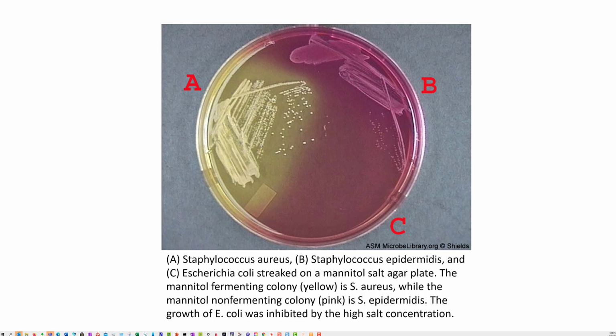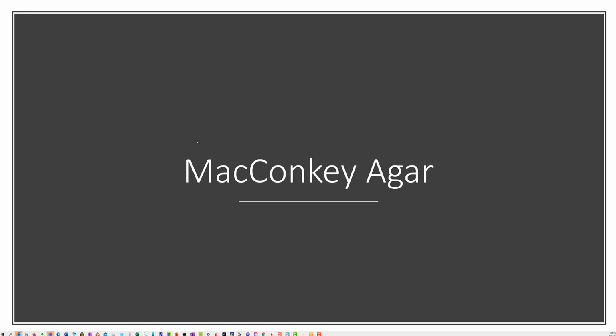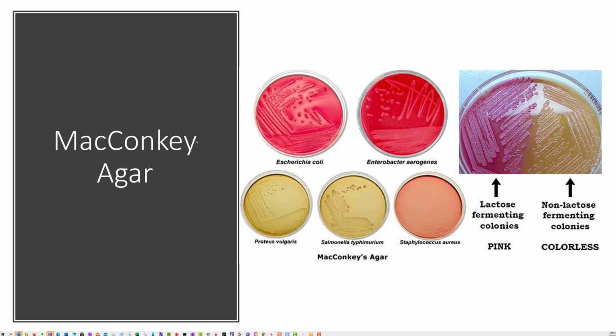But the staph will grow just fine, and it breaks down mannitol. So here's a really great collection of information that we can use in our court of law to convict. If our pathogen happens to be a Staph aureus, this would be mannitol positive, and it is growing on the high concentration of salt. So it just gives us some nice touch points there to add.